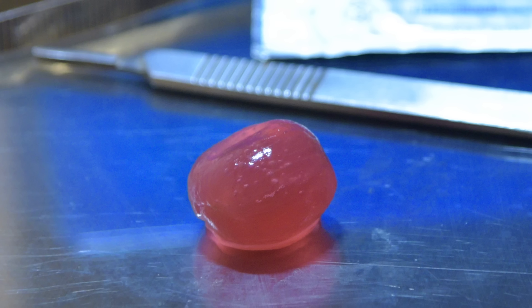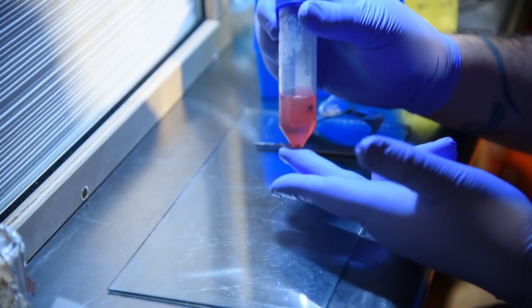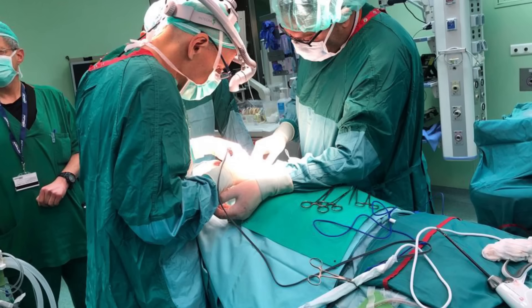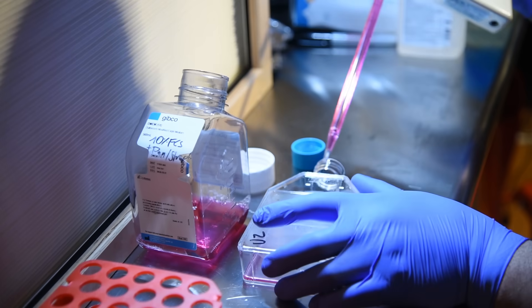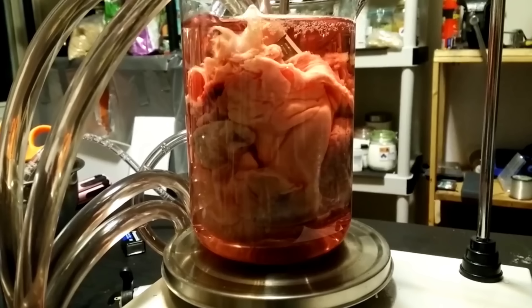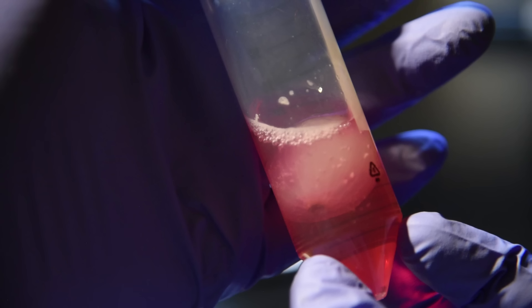All of that sounds very exciting, but what does it actually look like and how does the process work? That is the point of the meatberry. We get to make a really cool, super weird thing, and explore what could well be the technology that either puts food on your table or maybe even saves your life. And this is also going to be a tutorial with everything you need to know to do basic mammalian cell work. We've decellularized a lot of stuff over the years, mostly because it's just neat looking, but also because it's such a cool technology that it seemed worth it to understand it. We've tried a variety of fruit and veg, and I even did a whole pig heart, which was a rather laborious process.